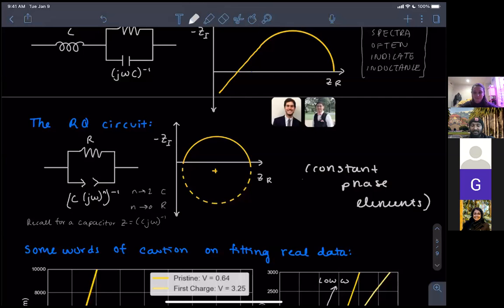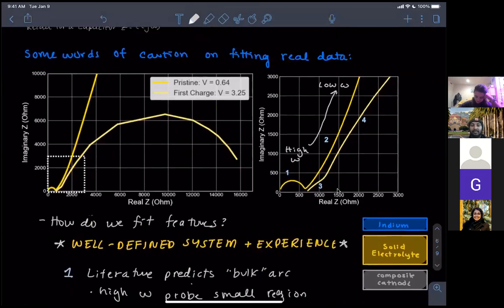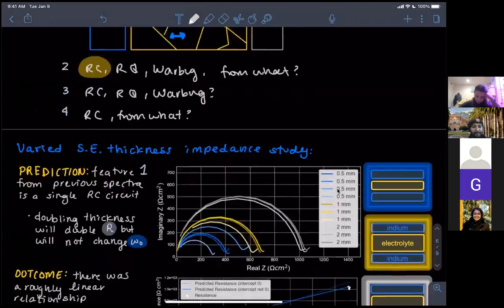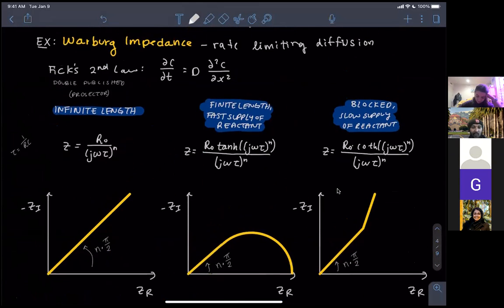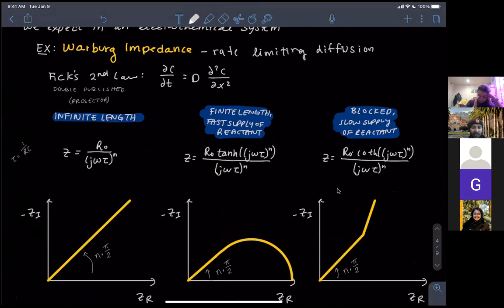I had a question. I don't know how much time we have, but I was wondering how you relate Fick's second law to current and voltage. I only briefly reviewed the derivation because it was several pages. Basically, you understand the diffusion of the reactant to the surface, and that's what's limiting it. The reactant in this case is your lithium ion, and you can equate lithium ions to electrons passed in terms of current, as well as chemical potential to potential. Okay, gotcha.